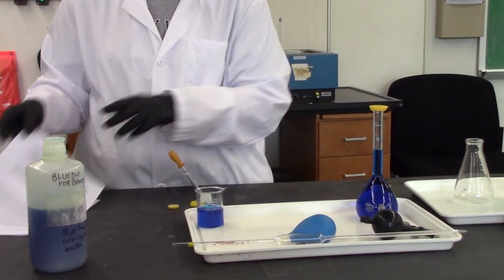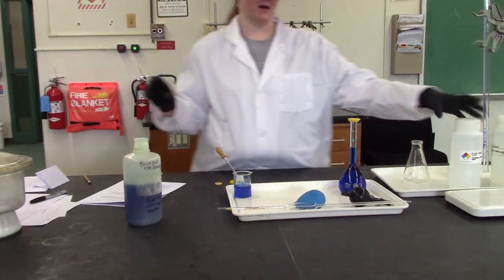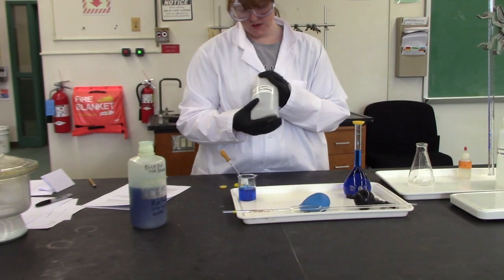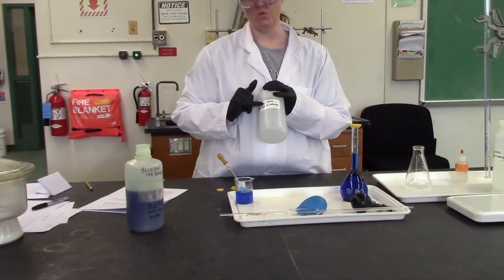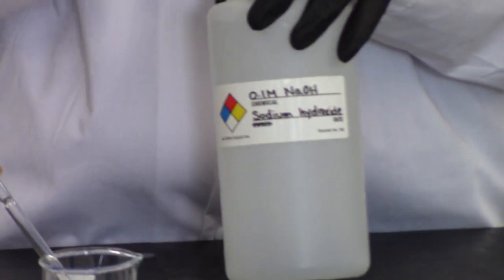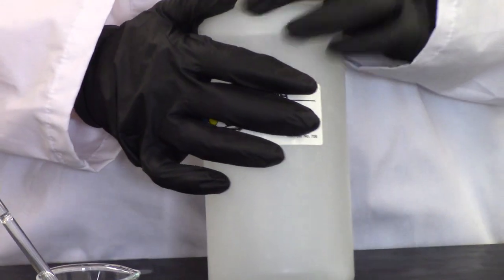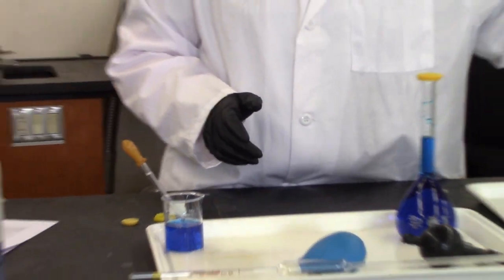Okay? So then part three is where we are going to standardize our sodium hydroxide. In other words, we only know this concentration to 1 sig fig, 0.1. We need to know it to 4 or more in order to be a standardized solution. So the first thing we have to do is prepare a buret.